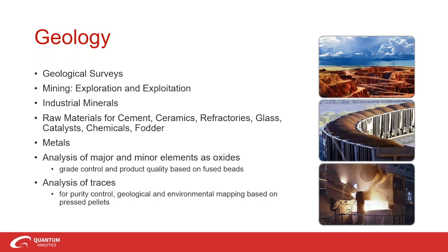Now, looking at geology, XRF is employed in geology laboratories to evaluate materials and products with a wide elemental coverage. You get wide concentration ranges and widely varying sample matrices. It's extensive.